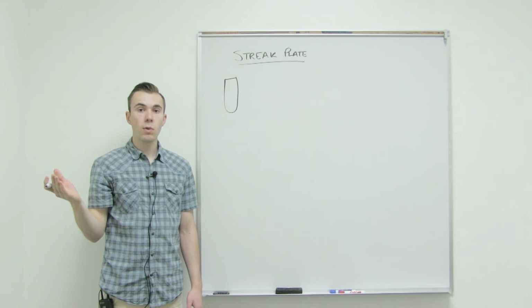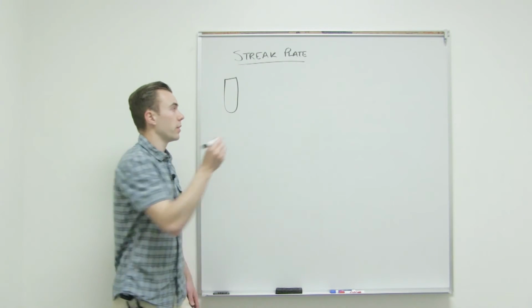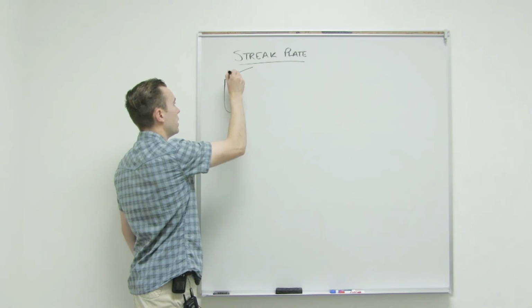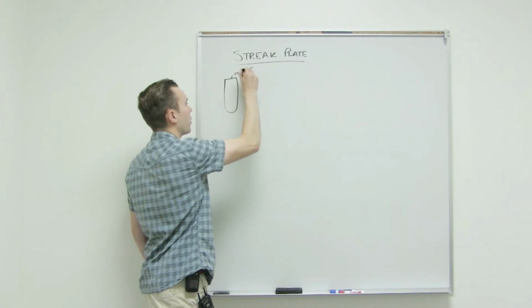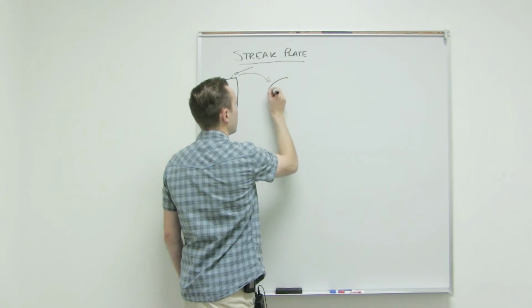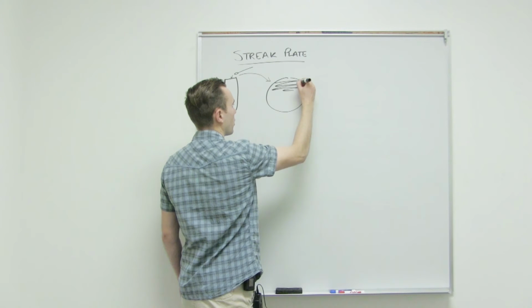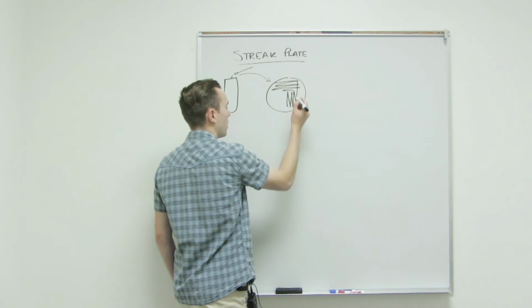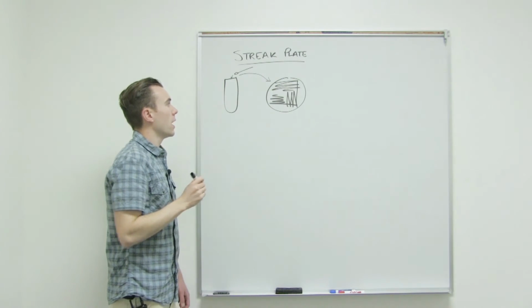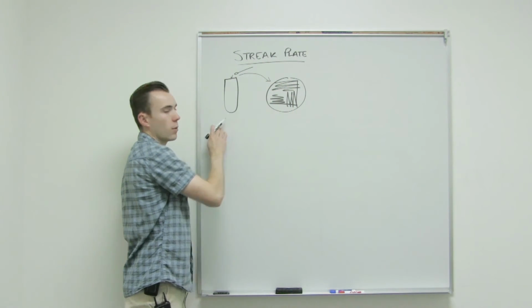And you're going to take what we call an inoculating loop. So basically it's just a metal loop. And you're going to dip it in here, and then you're going to streak it onto a plate. So you're going to streak, then you're going to pull across and streak, you're going to pull across and streak. And you only put it in once, and in between each one, you just pull without re-dipping.